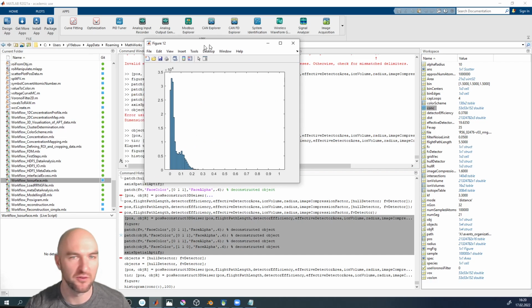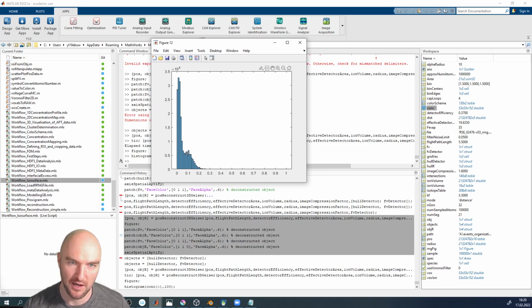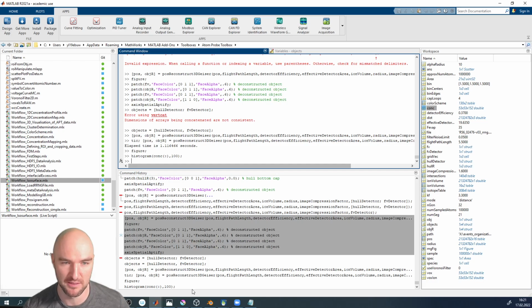Now if we look at that histogram, we can see we have some extra values here. So probably about here is a good cutoff. You can see this is the aluminum content in the matrix, and this is roughly the aluminum content in the precipitates. So round about here would probably be a good value. That's what, 7%, 7-8%. So I'll probably do 7%. Let's try 7% and see if it looks reasonable.